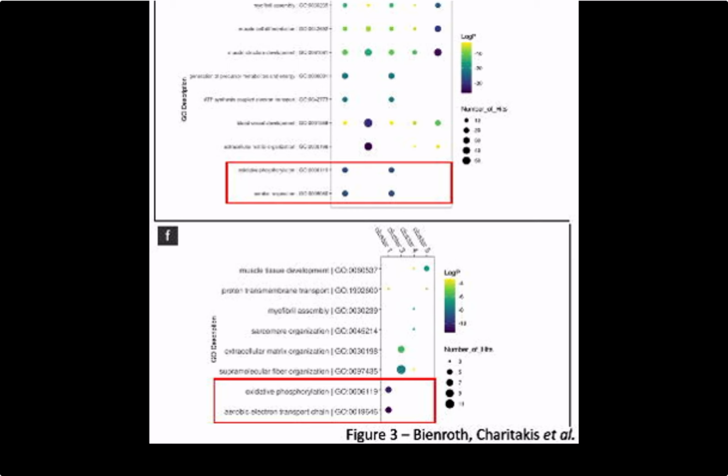Immunostaining with Ki67 indicating proliferation within the tumor, orange, nuclei staining, Hoechst, blue, cardiac troponin T, CTNT, green. Reconstruction and concatenation within VR-Omics of 3 coplanar, H&E stained slices separated onto different Visium capture areas due to size of the tissue. Example of STAGIT clusters visualized across the reconstructed coplanar dataset, labeled as Sample 1 in Panel A, within VR-Omics.